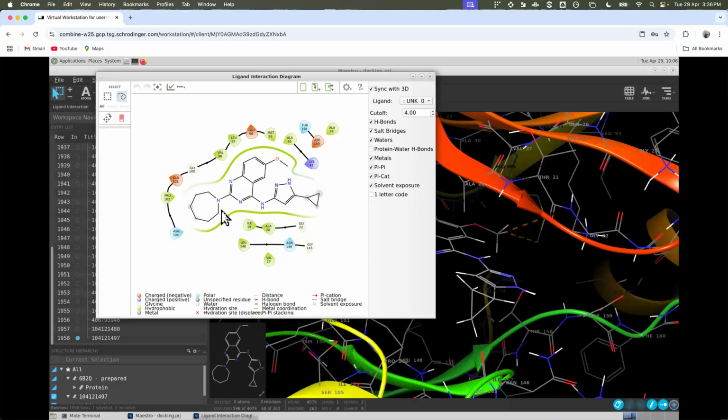If you are having a problem, let me know. This is very important. Before going to the docking score, you need to clearly understand how your ligand is binding to the protein. What are the residues that are interacting? Which residues are involved in the hydrogen bonds and non-bonding interactions? That you need to understand. Right? So, if you see this, then you can close it.